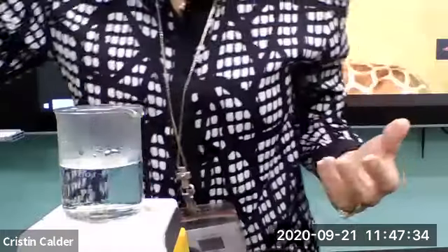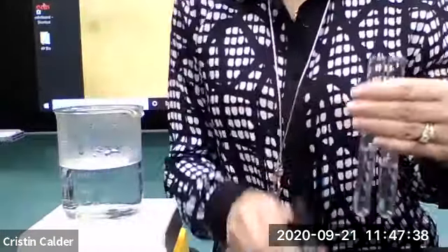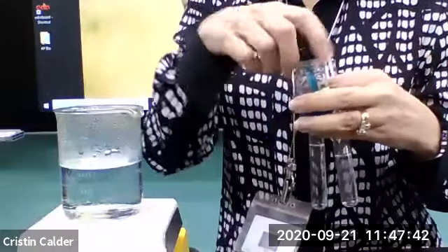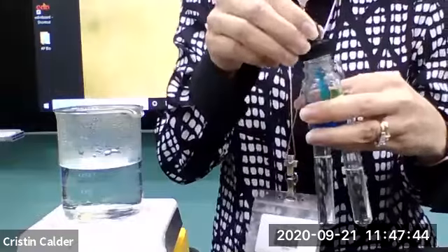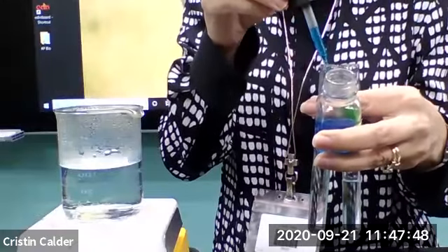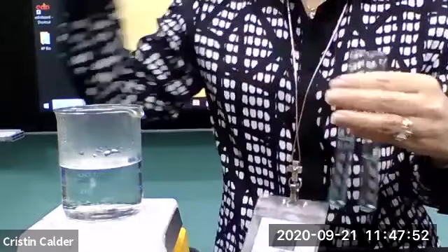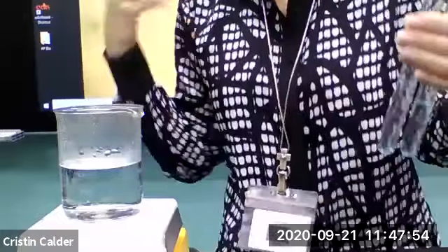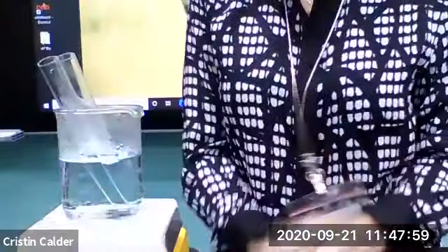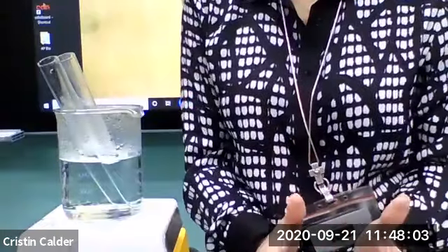So to both of these tubes, I'm going to add some Benedict's solution. Again, my standard is my positive control to show me what a positive test looks like, and my water is my negative control to show me what a negative test looks like. This way, when I test real foods, I'm going to know if they're positive or negative. If they turn the same color as the sugar solution, then I'll know that they were positive for sugar. If they turn the same color as the water, I'm going to know they're negative for sugar.